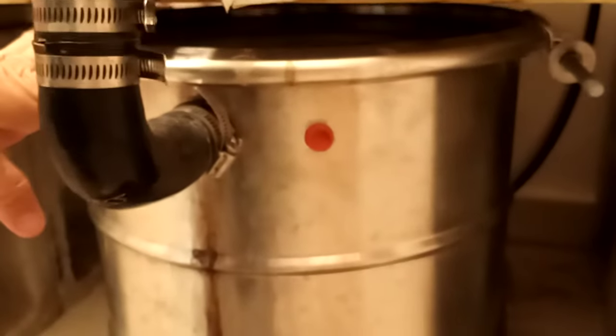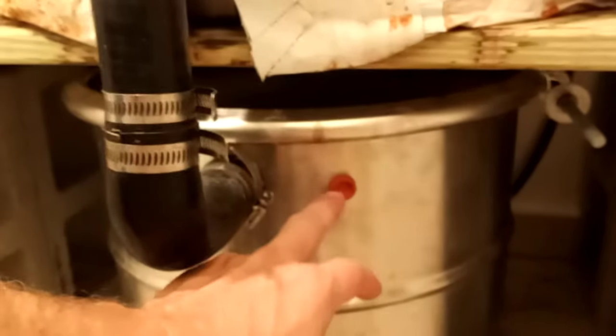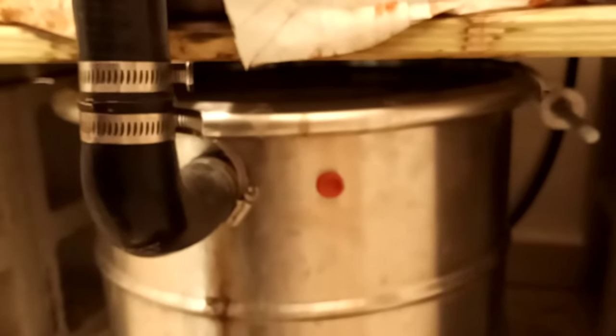You'll notice another detail that kind of escapes people: we have an injection port drilled into the side here, and that's actually a safety measure. If pressure ever builds up inside for any reason — like if the tube gets clogged or melts — it'll pop this cork out first through a hole in the stainless steel. Since this is an atmospheric steam sterilizer it shouldn't build a lot of pressure, but if it ever did, that's the safety measure. We also have those corks in the lids, so if there's ever a pressure buildup there — maybe the holes get clogged — it'll pop that center cork. Those are the safety measures we installed to make sure they wouldn't hurt anybody or blow up.